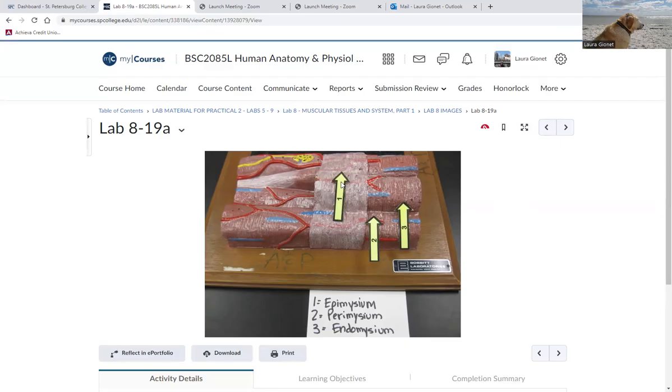What you can't quite see, and it would have been nice if they had a slightly better color change, is this epimysium is kind of a pretty darkish white color. The next, it's like a little step down, is the connective tissue surrounding each of these long, horizontal clusters of muscle cells. Those are fascicles. And there's a slight step down, but this tissue here at 2 is the perimysium. Then there's another little step down here. So you see the connective tissue surrounding one particular cell.